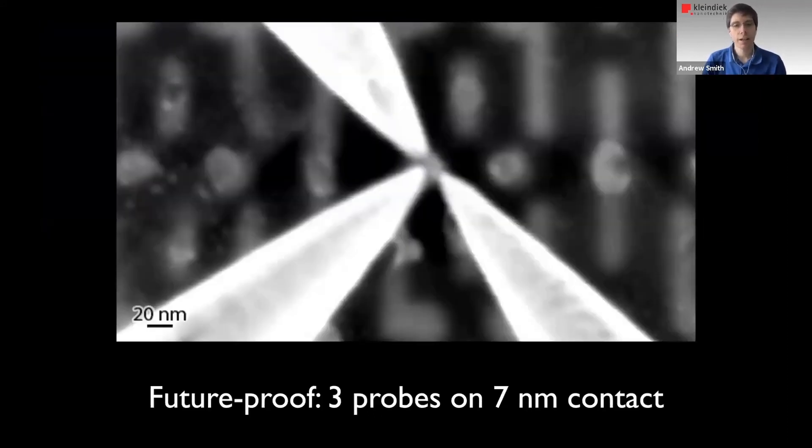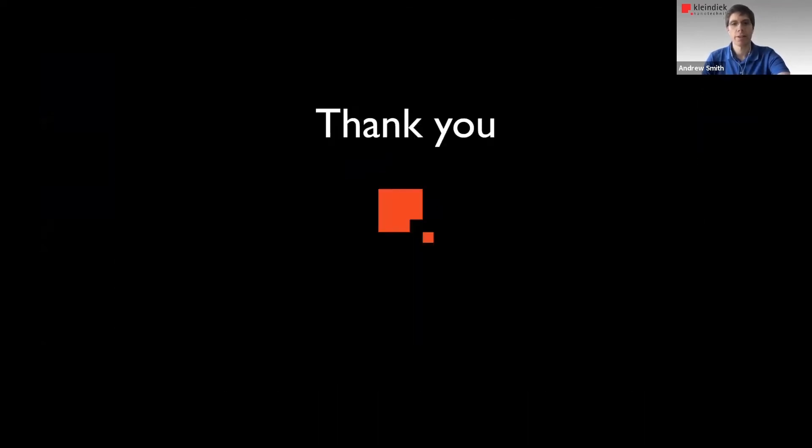And finally, we think that we're ready for the future because we have high stability and this image shows three probes placed on a seven nanometer contact and they stay there for long times. So we don't have a few nanometer sample yet, but we're ready for it because we have this high stability. And with that, I would like to thank you for your attention.